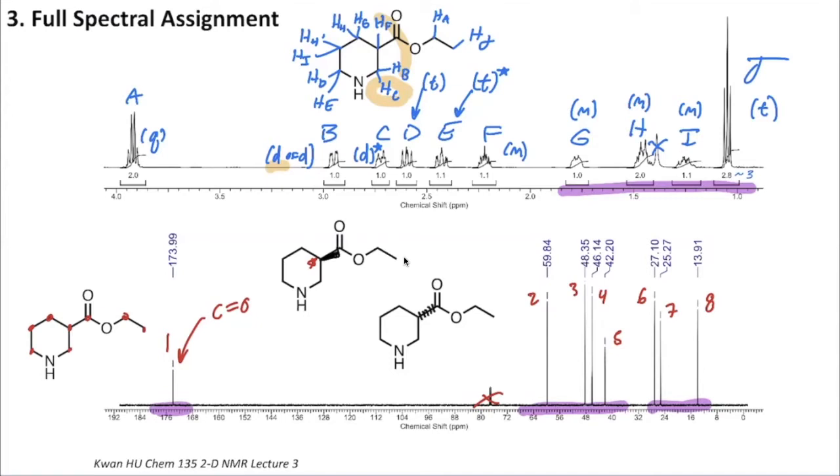Those are a pair of enantiomers that could both be represented by the structure that we have up here at the top. Because our original structure only gives us a single solid bond, no stereochemical information, we can't be certain if we have one or the other stereoisomer. In fact, we might have both. That could explain why we see such strange splitting here. Either way, we do have to be thinking about the stereochemical nature of this compound as we move forward with our analysis.